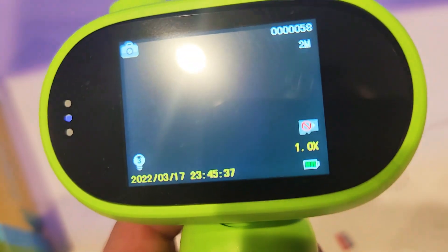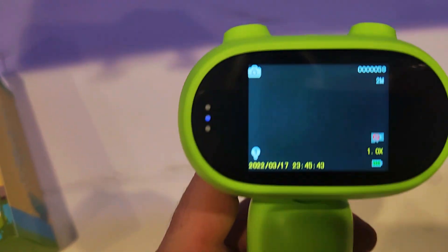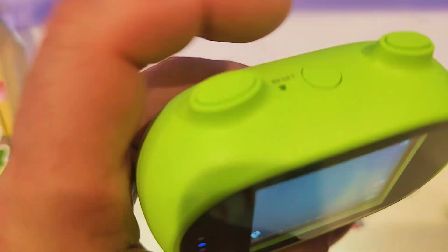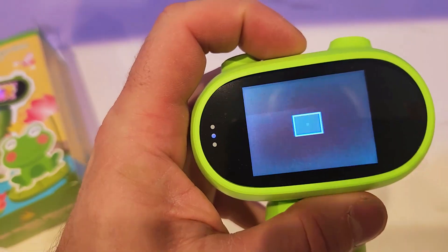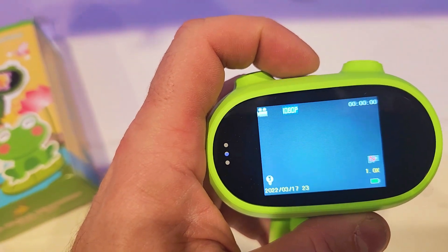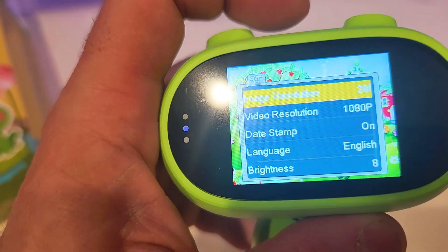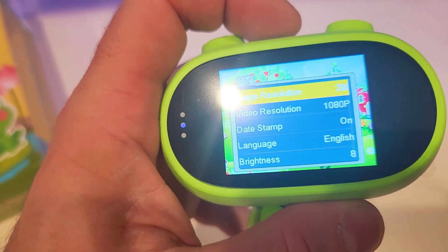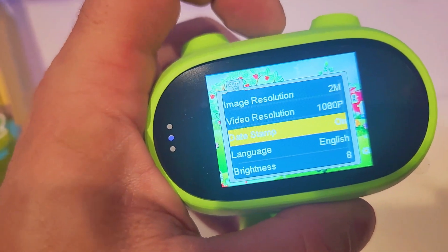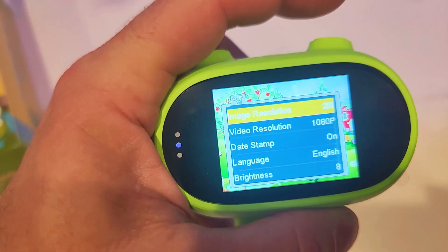Let's go and turn this on right now. You're going to see right here: no SD card indicator, the timestamp, it shows the LED lights are on, and it shows you're in 2-megapixel mode. Let's press the menu button. If you short press, it switches between playback, photo, and video. If you hold it, you're going to get the menu settings for that particular mode you're in. Right now we're in video mode. Use the arrows to navigate, menu to enter, and hold again to set.